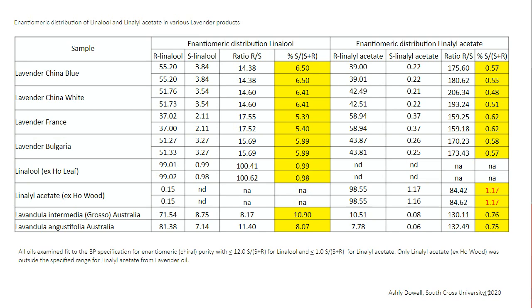And if linalool is added to lavender oil from an external source, it will lower the D percentages. Of course, there is some play in the process by which the oil is produced. In this way, we can utilize chirality for adulteration detection, but make sure the oil is produced by the same method. When you try to compare, sometimes method matters for some molecules, not all.